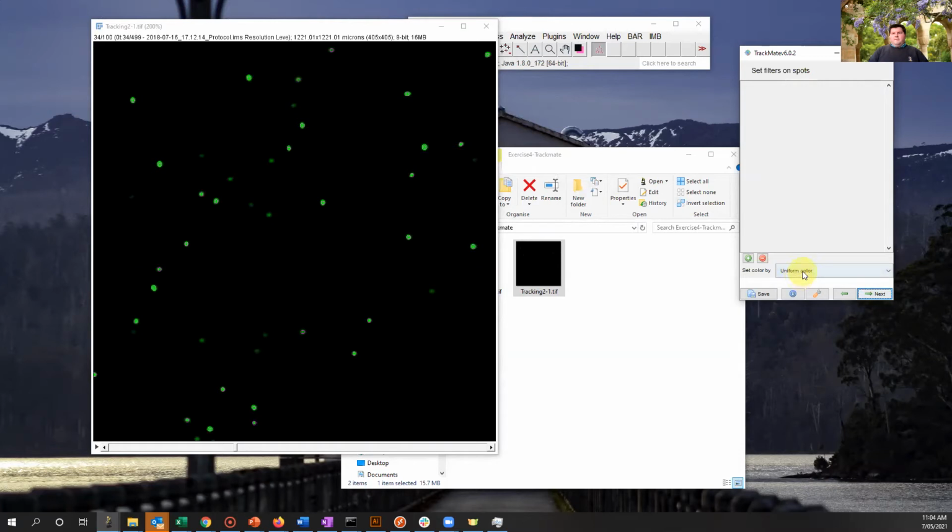We can apply some filtering if required. So we can say we want to filter based on the time frame or the radius, all these many options. So we can adjust these by sliding, or if we change the option, we can choose from the below. So let's pick most of those slices, or we can auto calculate, and then we can continue on.